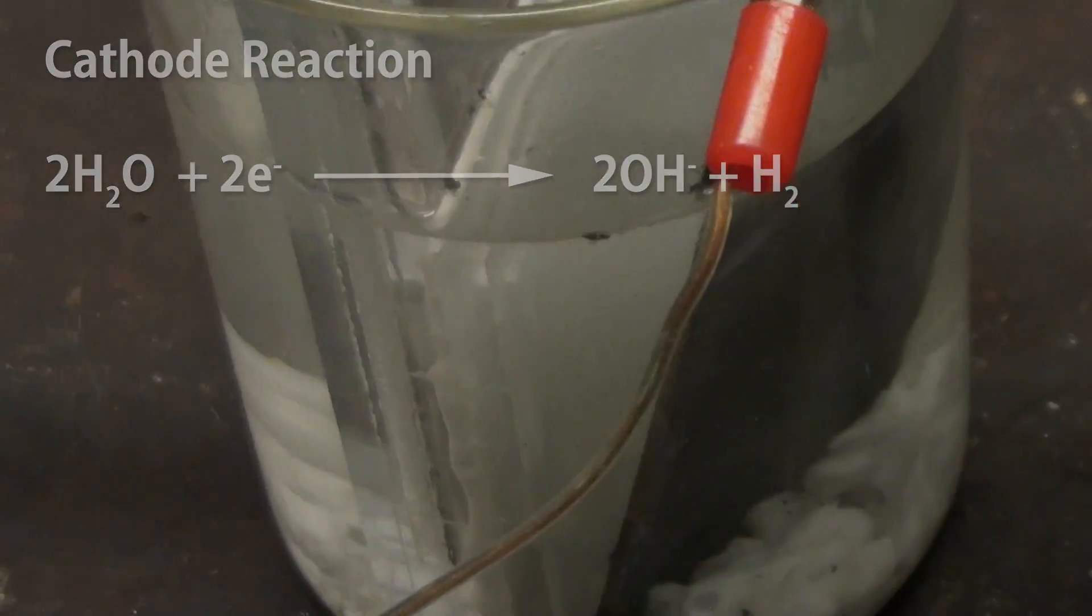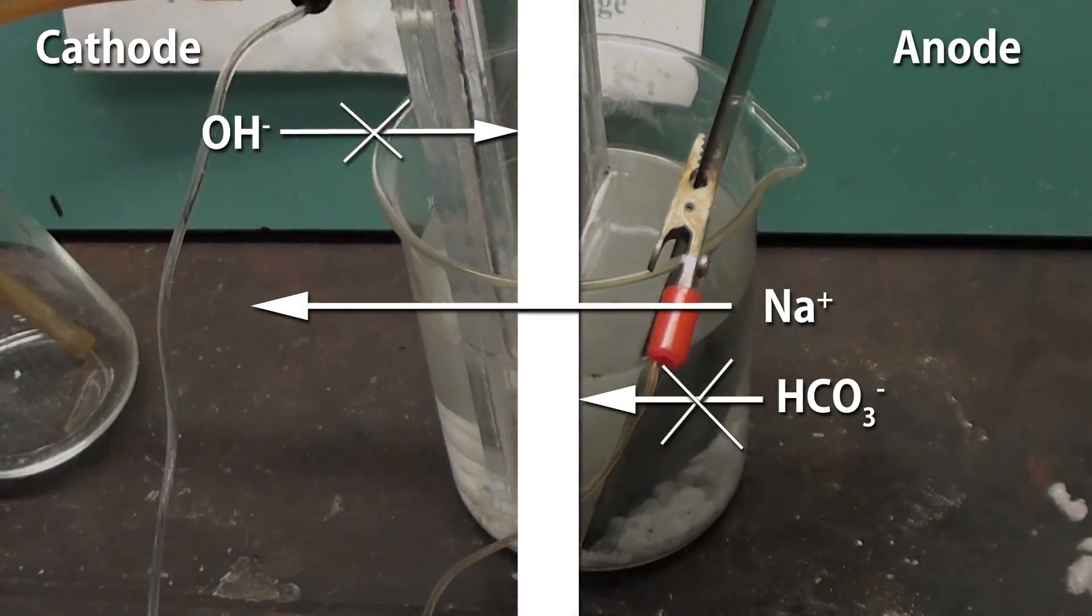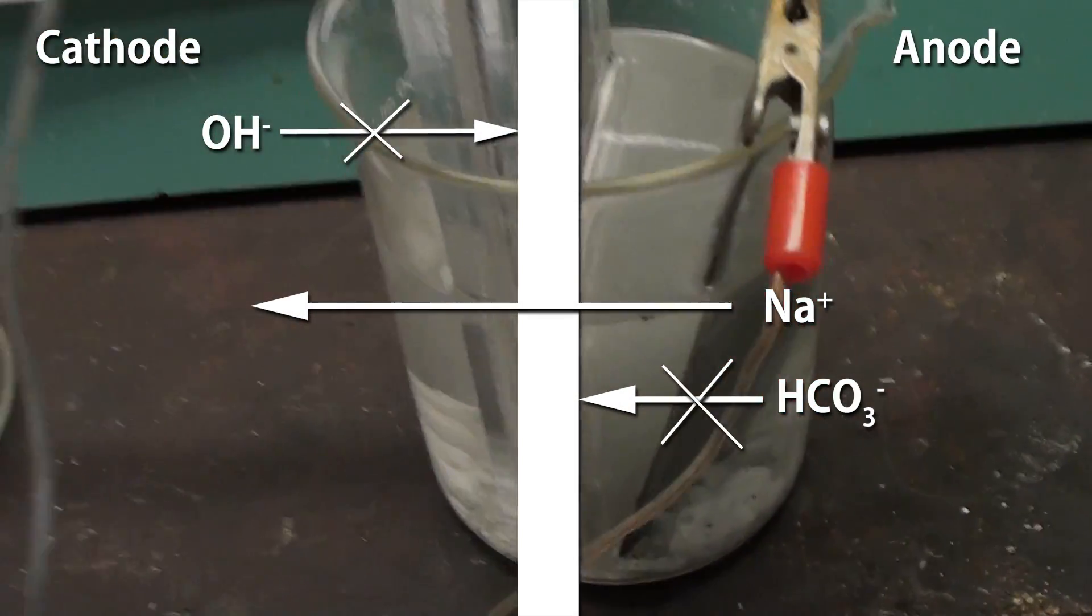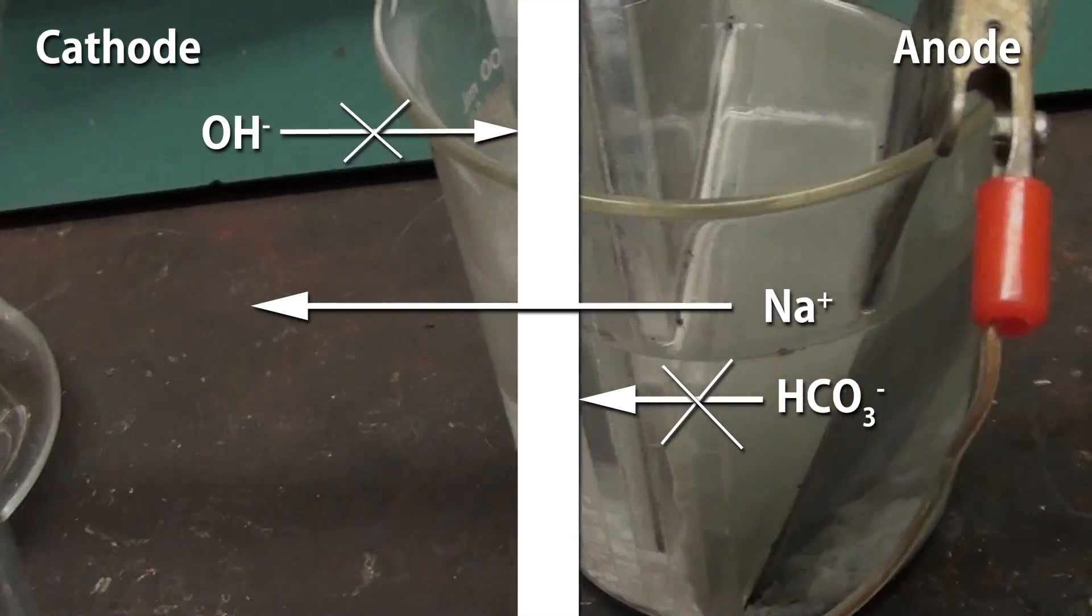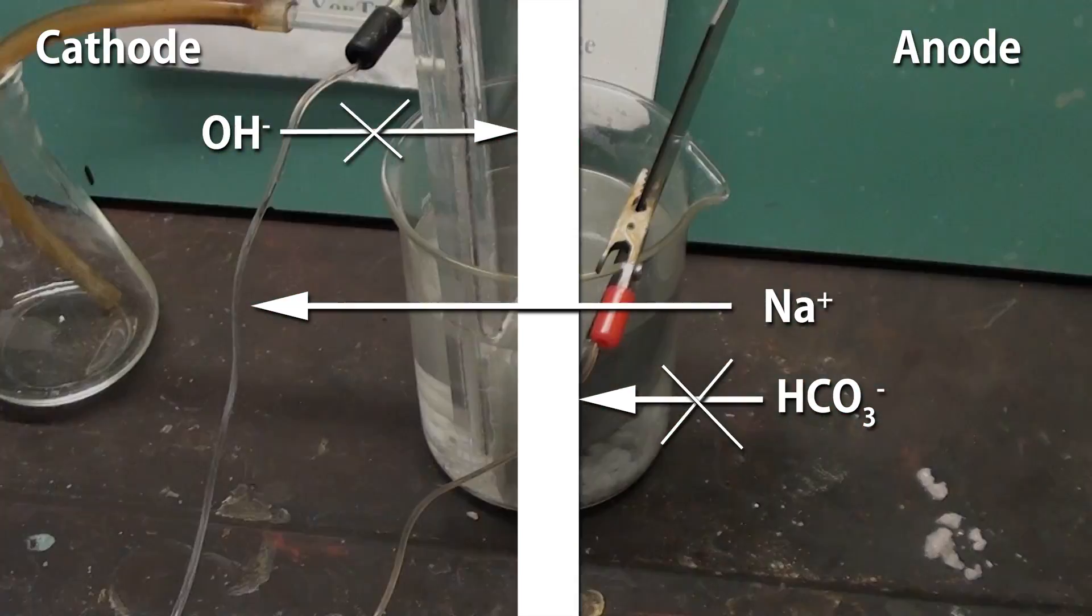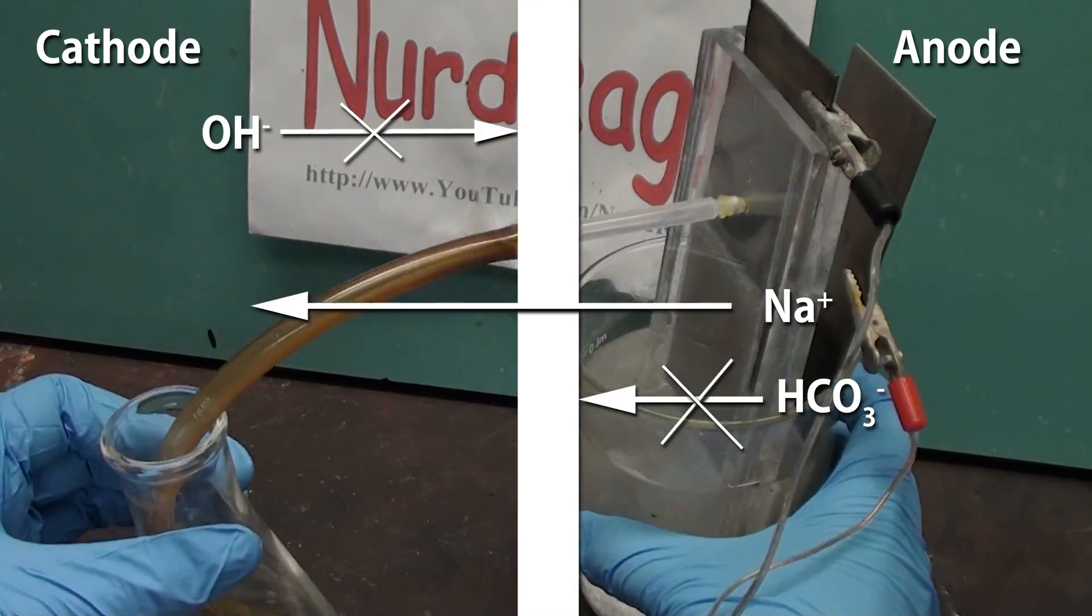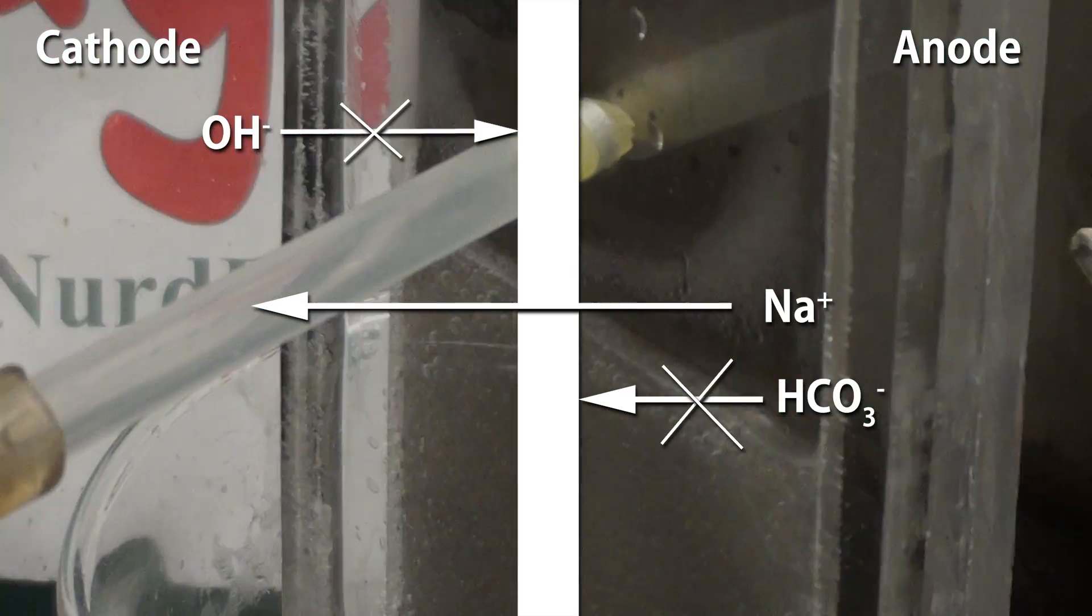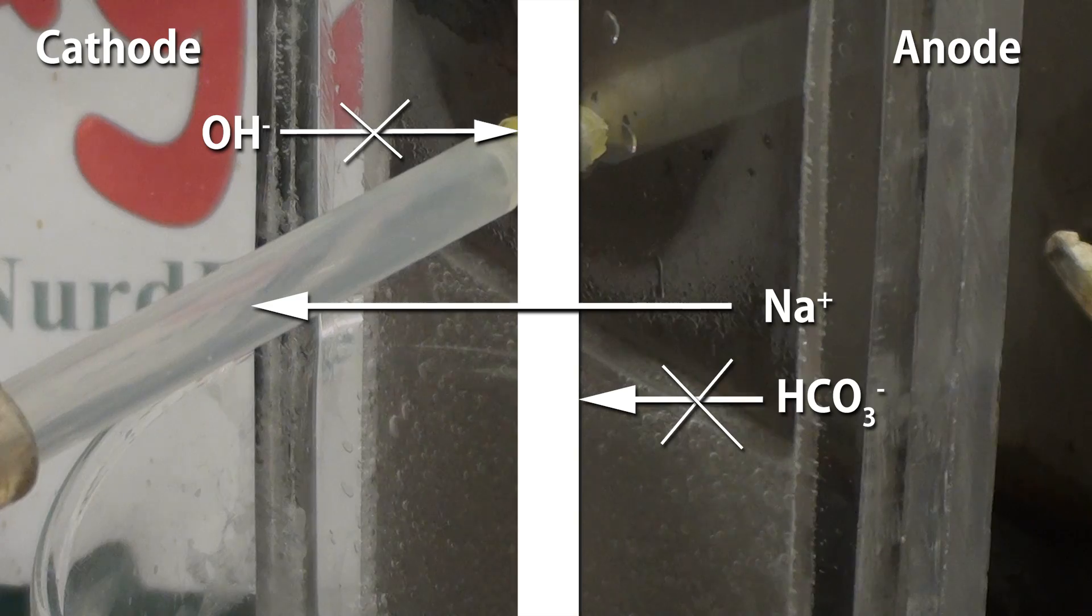But the amazing stuff happens at the membrane. As hydroxide builds up in the cathode compartment, charge balance must be maintained. You cannot have a significant imbalance of charge. The anionic hydroxide ions cannot cross the cationic exchange membrane. But the cationic sodium ions can.